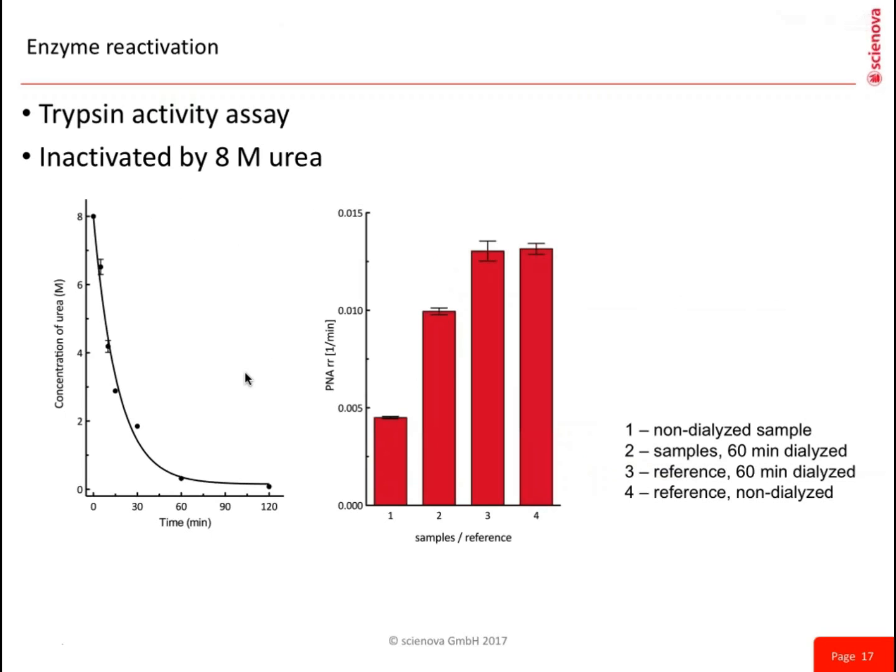One typical application is the reactivation of a protein or enzyme after it was inactivated by using, for example, urea in a purification step.